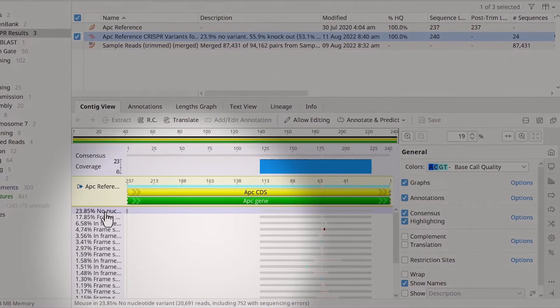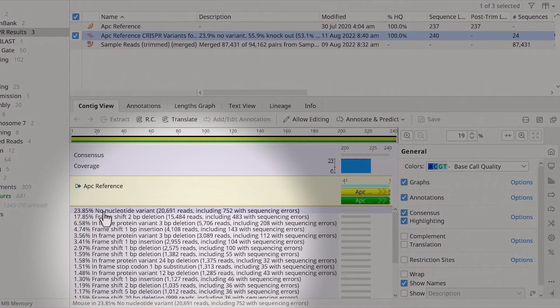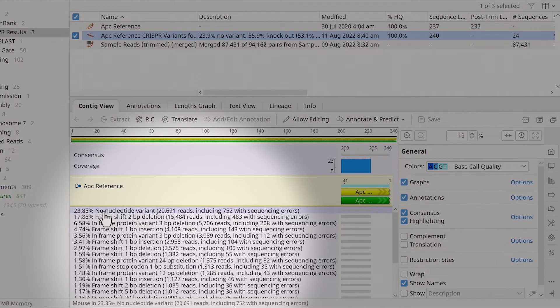Each aligned sequence is named as follows: variant frequency, followed by the variant effect, and in parentheses, the total number of reads in cluster and the number of reads with putative sequencing errors in cluster.